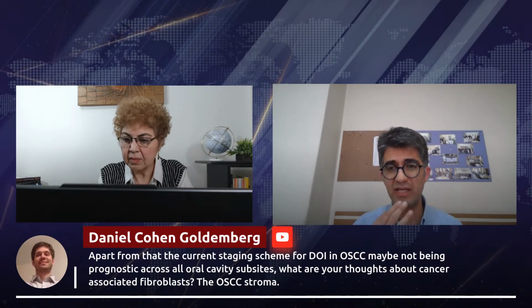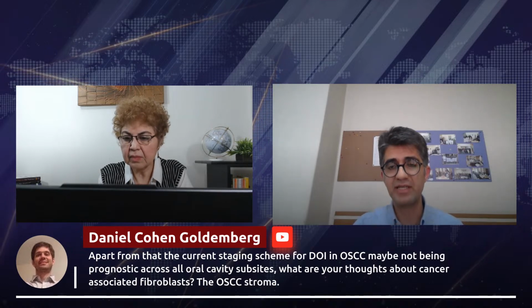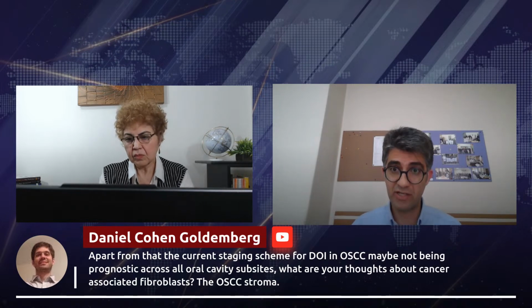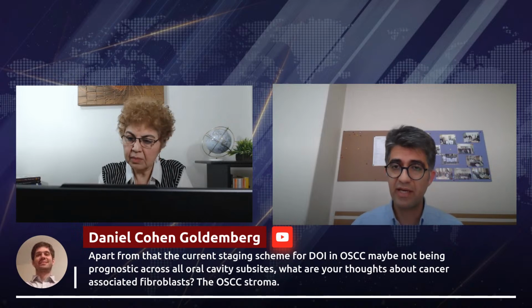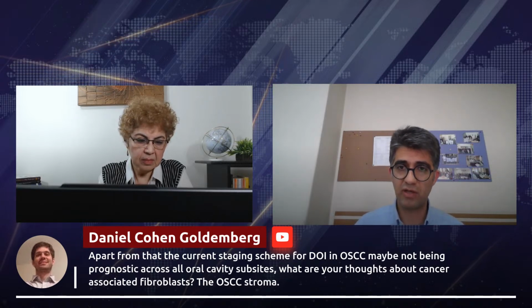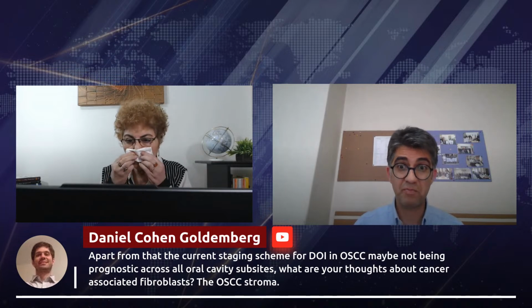When we have an oral squamous cell carcinoma of the lip and oral cavity, we assess depth of invasion and report it to the surgeons. It depends on the treatment plan designed by the surgeon and oncologist. What do they think about the depth of invasion?